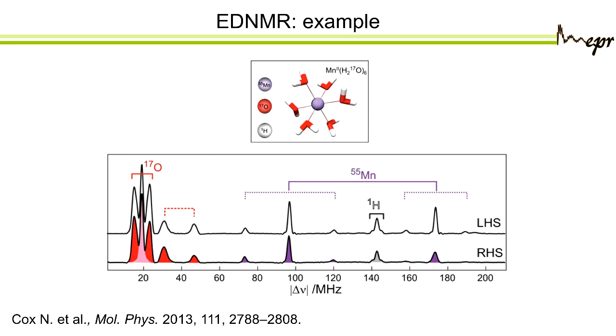And what's nice here also, you see the proton. So the proton, this method is not very good for the proton. You've seen very nice powder pattern with ENDOR. When you do this method, you lose this resolution. So if you want to measure protons, I wouldn't do ELDOR-detected NMR, but N14, O17, this would be probably much easier than ENDOR.